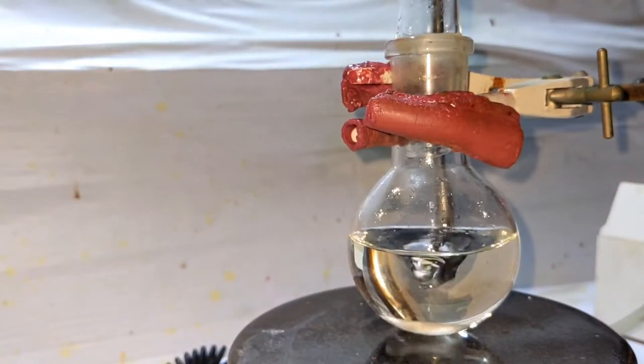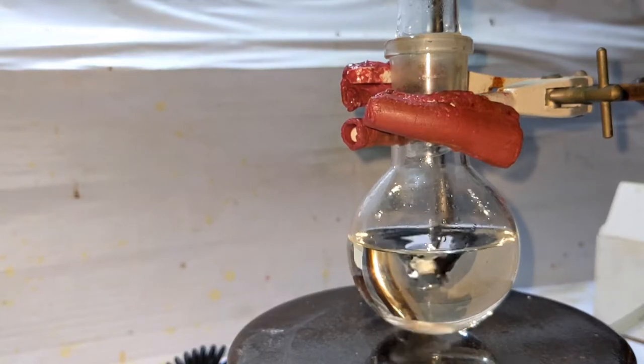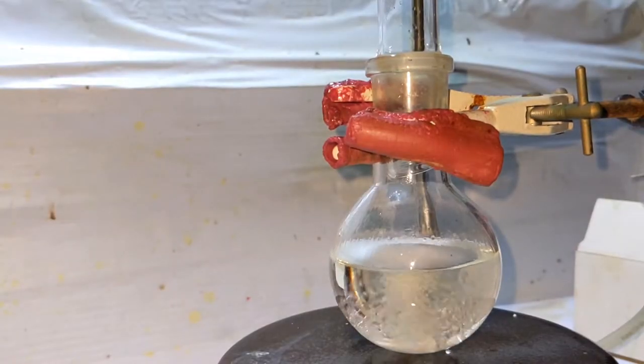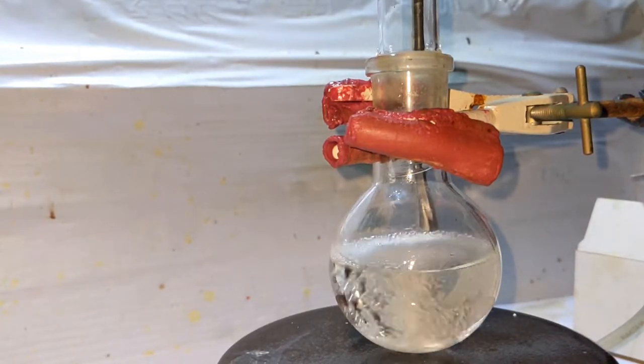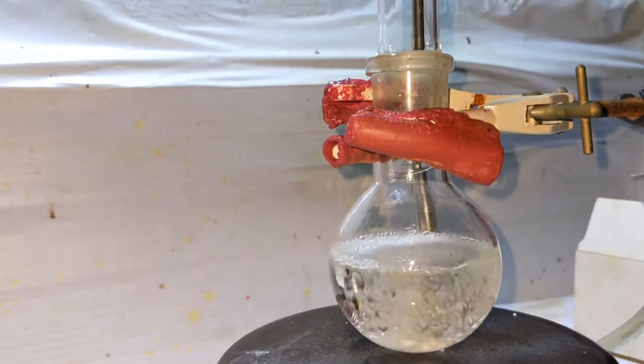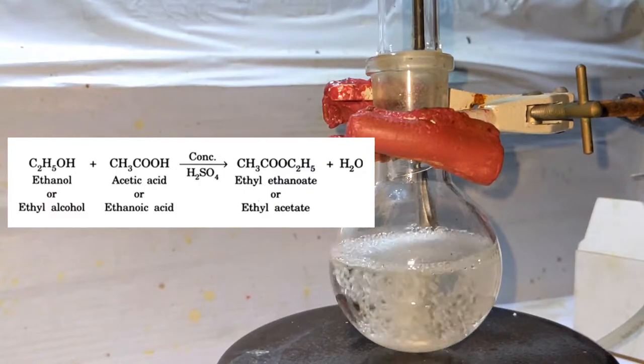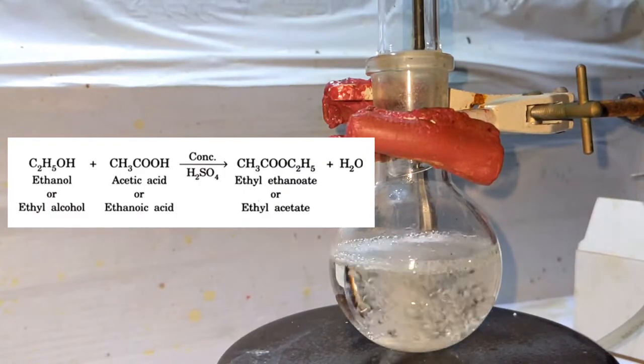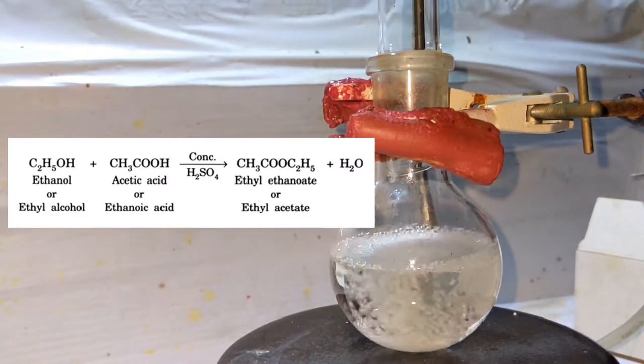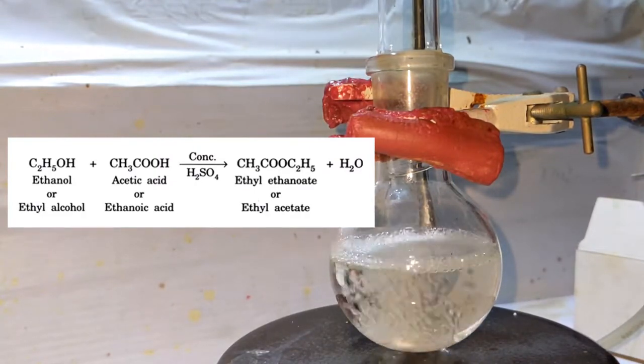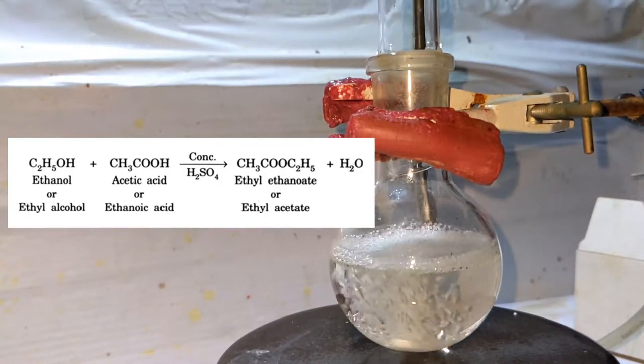Now a reflux condenser is attached on top of the flask and the mixture is refluxed for 30 minutes at around 90 degrees Celsius. Let us see what is happening here. It is the Fischer esterification process where the carboxylic acid in the presence of alcohol and a strong acid catalyst forms ester along with water as the byproduct. Here, acetic acid and ethanol form ethyl acetate.